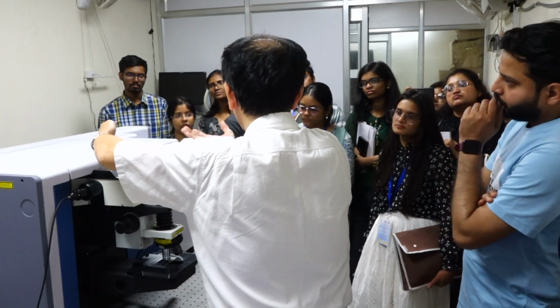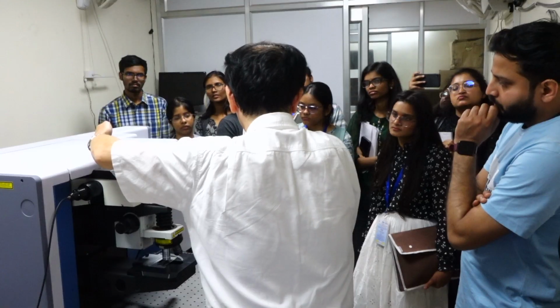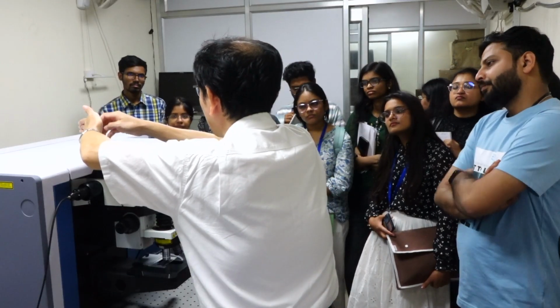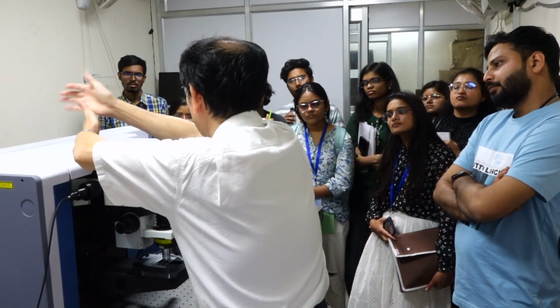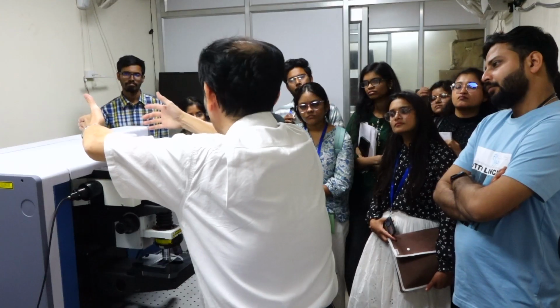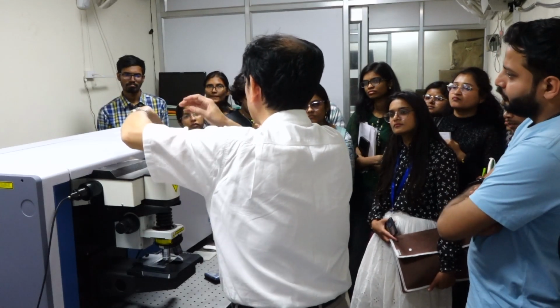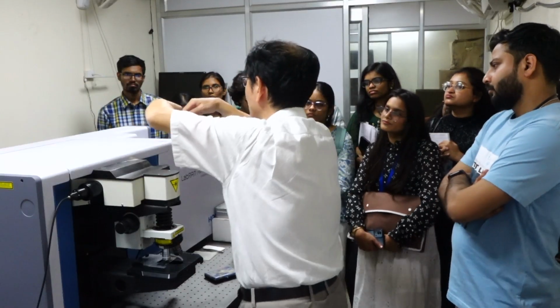The Stokes line of Raman scattering always has a longer wavelength. Then this dichroic mirror reflects the Raman scattering, and the Rayleigh line goes straight. So this is the first separator of the Rayleigh line and the Raman line. And perhaps one more filter should be located somewhere before entering the monochromator. And here is the monochromator.